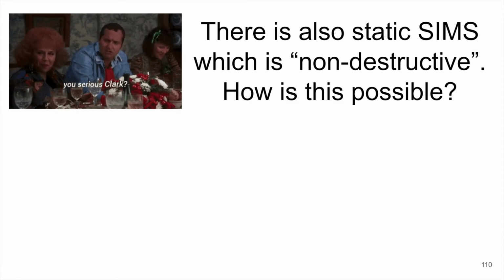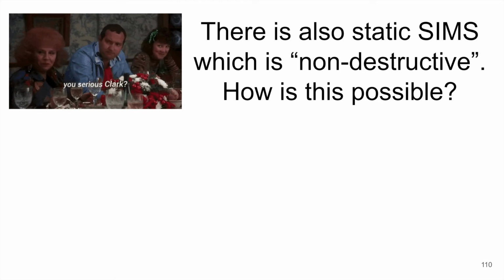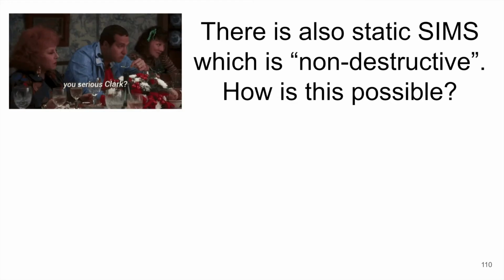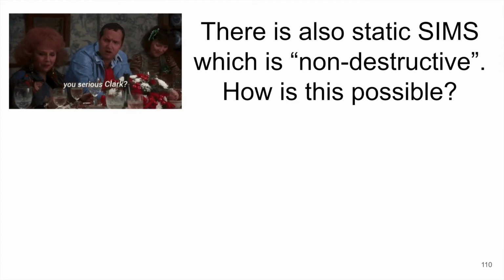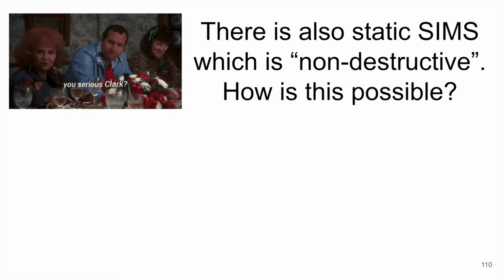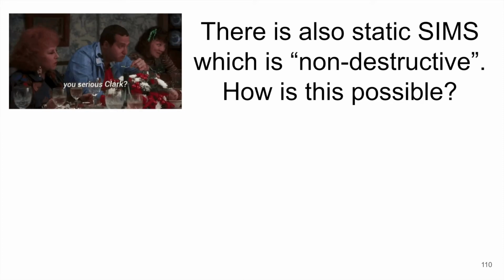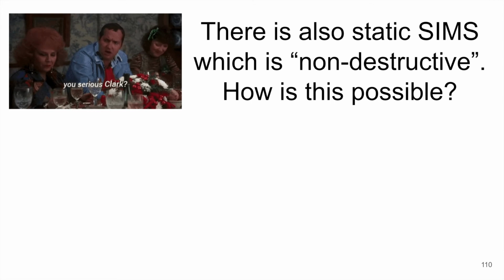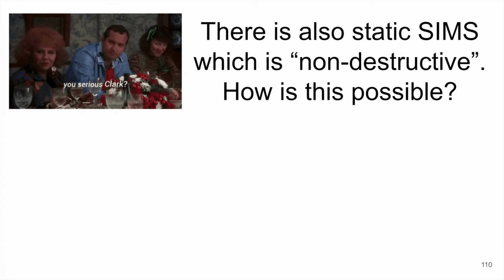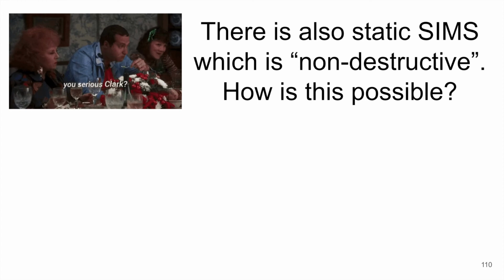All right, so with that in mind, we talked about dynamic SIMS. So you can imagine there's something called static SIMS. And so static SIMS is termed non-destructive, right? But I've also talked to you just now about what SIMS is. So with those two ideas, what SIMS actually is and this static SIMS, which we're terming non-destructive, how can we sort of reconcile those two different ideas? So how is this possible? See if you can come up with an answer, brainstorm this a little bit, pause the video and go answer this on the weekly quiz.